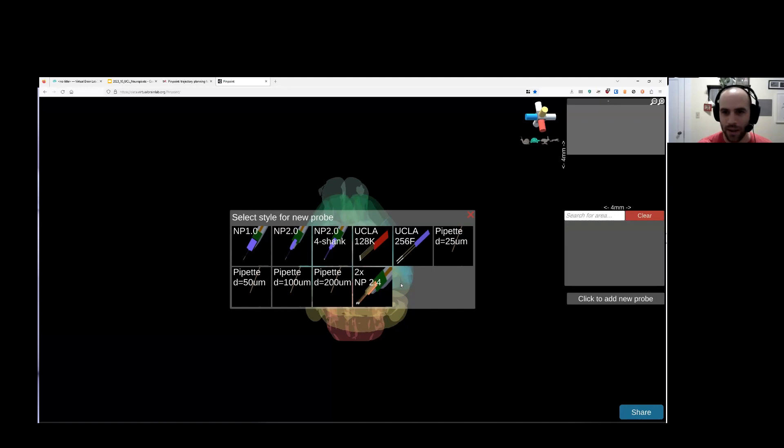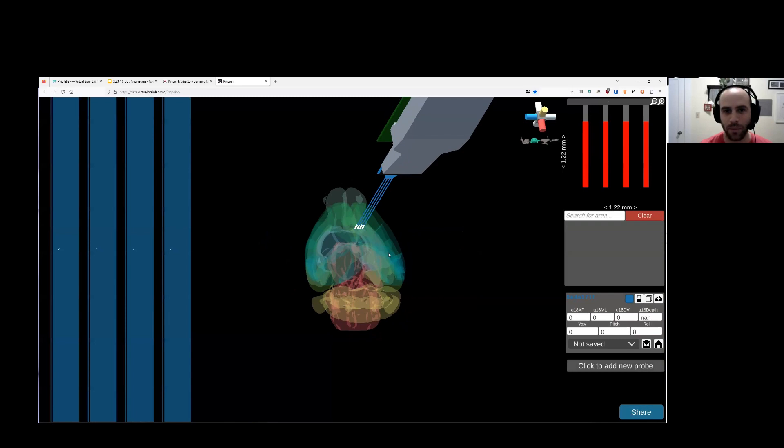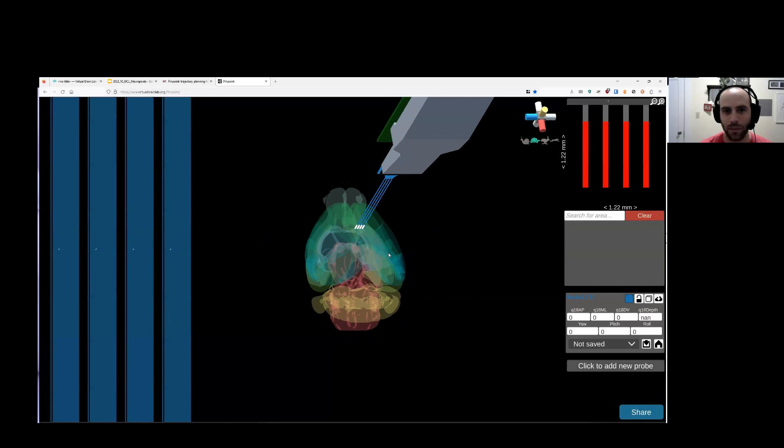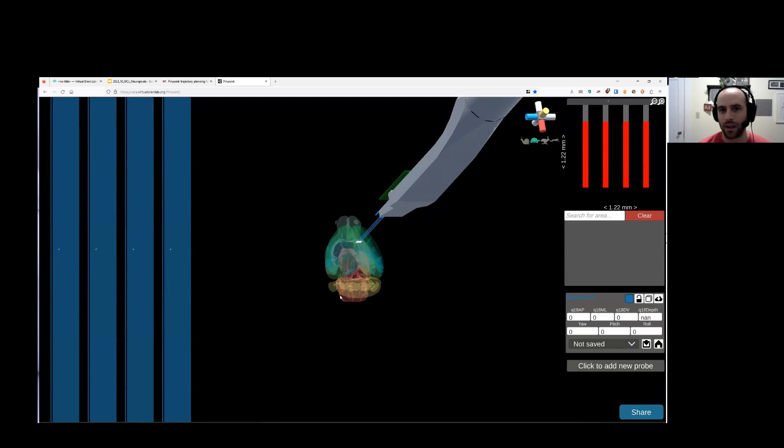You can drop different probes. Right now, we have a small selection of probes. We're hoping to add more. Let's plan with a 4-shank Neuropixels probe. So I just dropped the probe in the scene. You can see the 3D model, the scale relative to the mouse brain. And seeing that 3D space, I think, is really helpful for people who are unfamiliar with these probes.